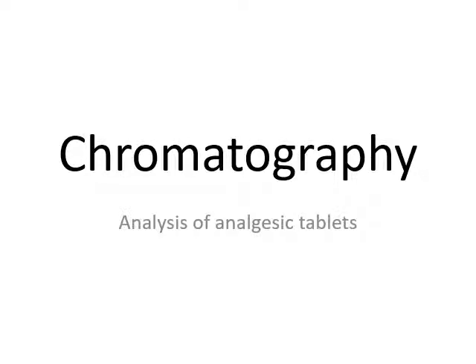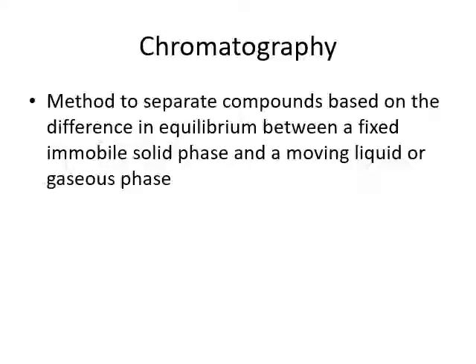Welcome to Liquid Chromatography, and you will be conducting the analysis of analgesic tablets. Chromatography is a method used to separate compounds based on the difference in equilibrium between a fixed immobile solid phase and a moving liquid or gaseous phase. It's not based really on solubility. It's more about the equilibrium achieved between the immobile solid phase and the moving liquid or gaseous phase. In this case, we'll be looking at the moving liquid and an immobile solid phase.